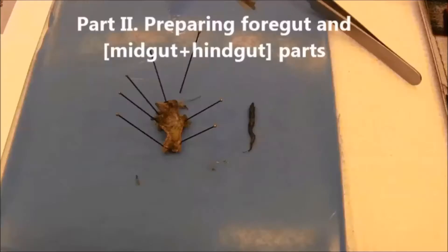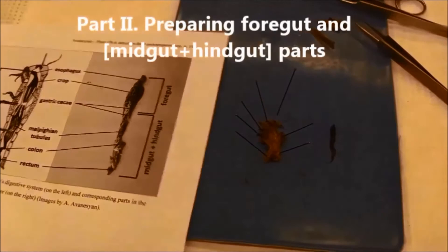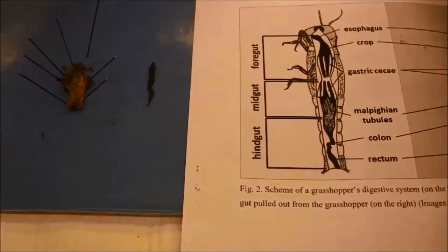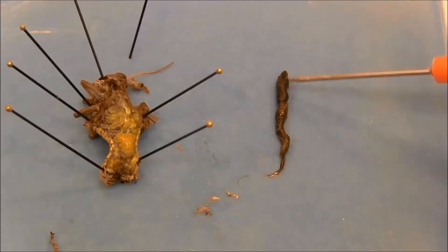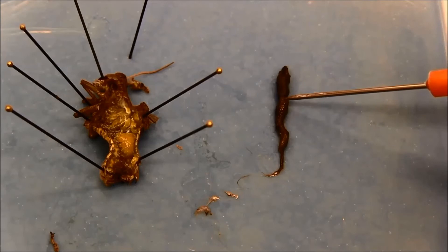To prepare different parts of the gut for DNA extraction I need to review the scheme of a grasshopper's internal structure to match the main parts of the digestive system. The fore gut includes the buccal cavity, pharynx, esophagus, crop and proventriculus, after which the mid gut begins.